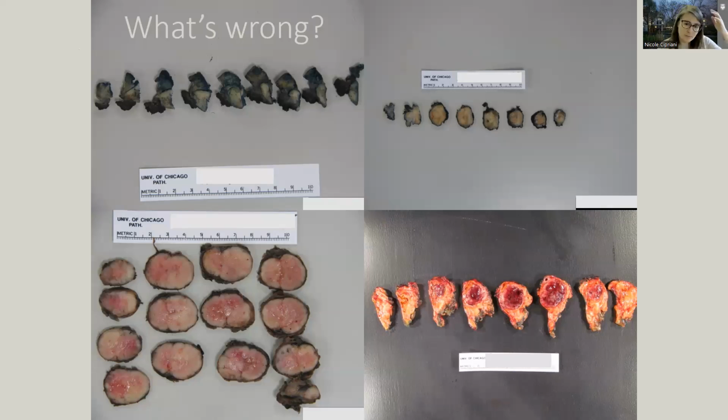Okay. The other improvement I could make on these sets of photographs. The person here was extraordinarily thorough, and that's cool. They photographed every single slice of the tumor, so you could visually walk through it from top to bottom. As a pathologist on the receiving end of this case, where I haven't seen the gross, this is really cool because I get to see it as they saw it.